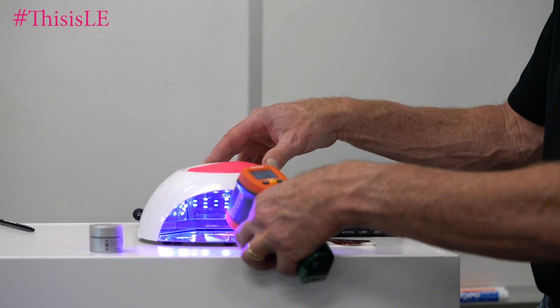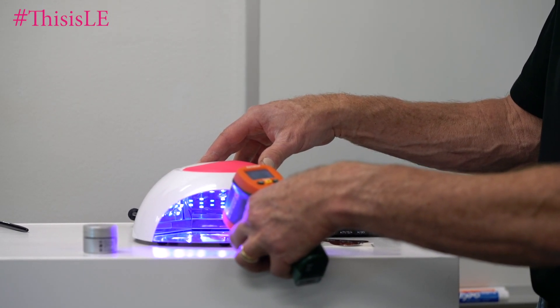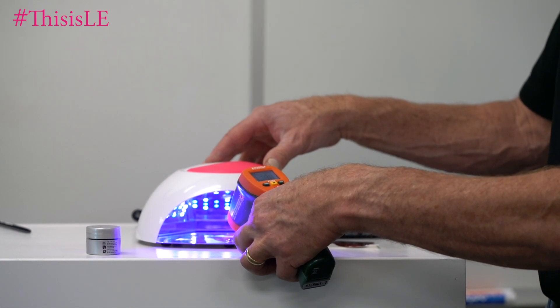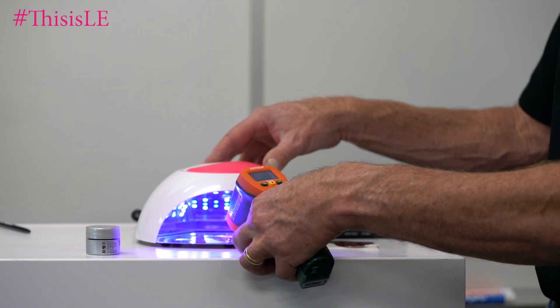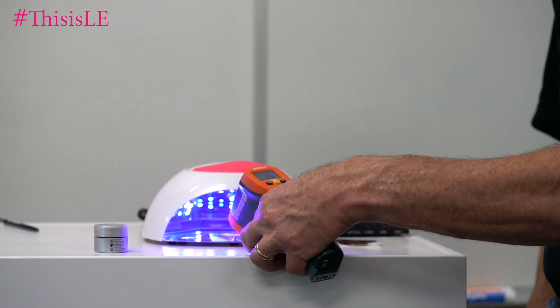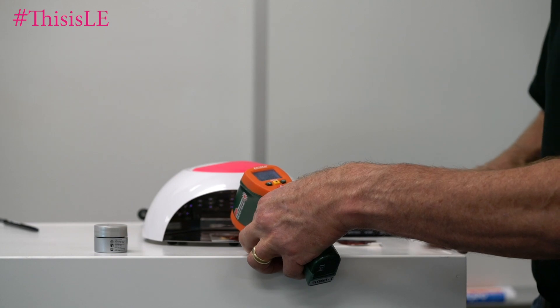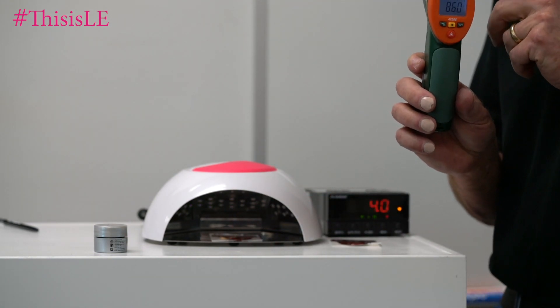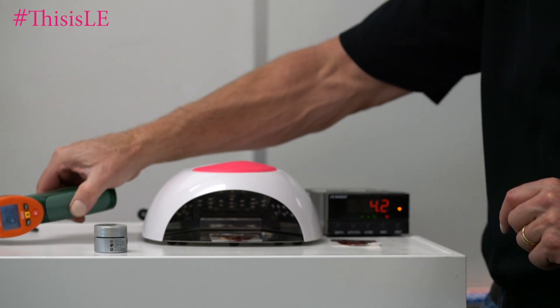So that's going to be about our peak. At 86–87 degrees, that's our maximum exothermic reaction — we're back down to 86. So that's one way to measure it. That's our maximum exothermic reaction using an infrared thermocouple.